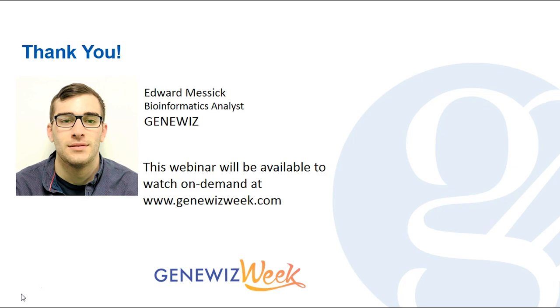And just for the interest of time, we will be taking one more last question. Again, there are two parts to this question. One is, does similarity of sequences limit the ability to distinguish species? And are there any known biases to the shotgun method versus the targeted approach?